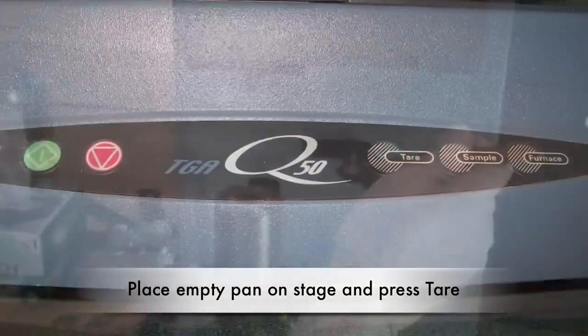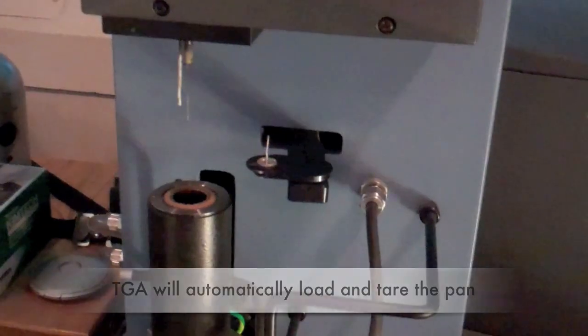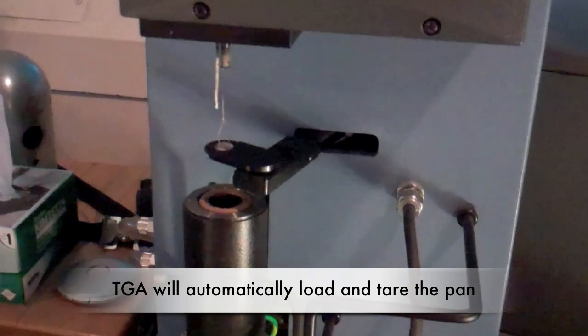Using tweezers, place an empty pan — either alumina or platinum — on the TGA shelf. Press the tear button on the instrument and wait as the machine automatically completes the tearing process.